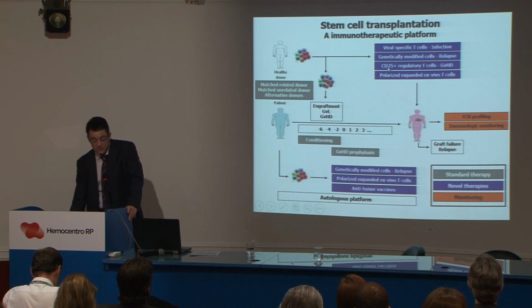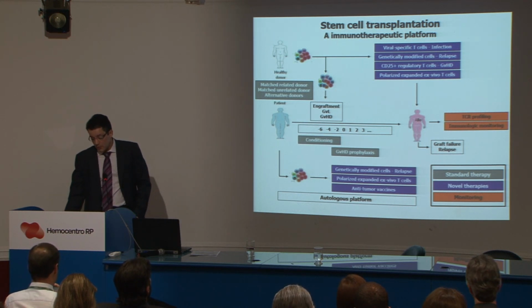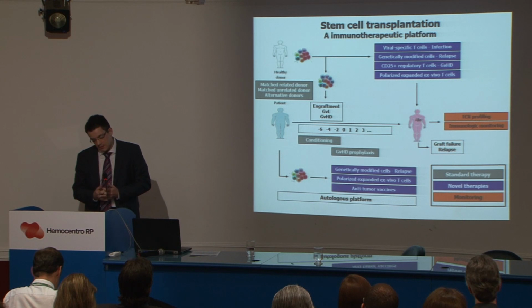I didn't talk about Treg, but you can use rapamycin for that. You can polarize the cells, as I showed you, or you can also merge these platforms and see what kind of results you have in the preclinical process.